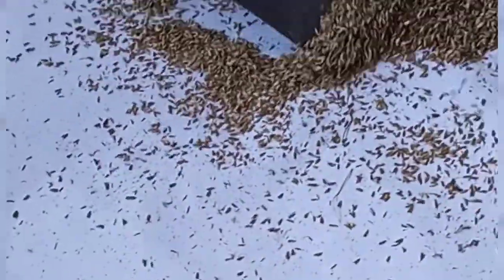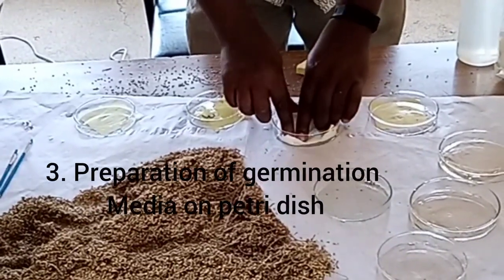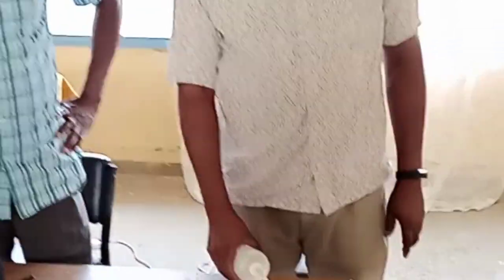After the extraction, you prepare your petri dish by using a soft cloth. Then you add some water, plenty of it.